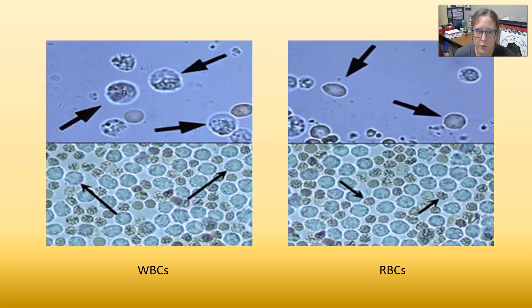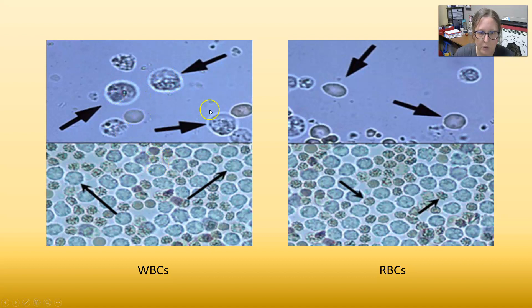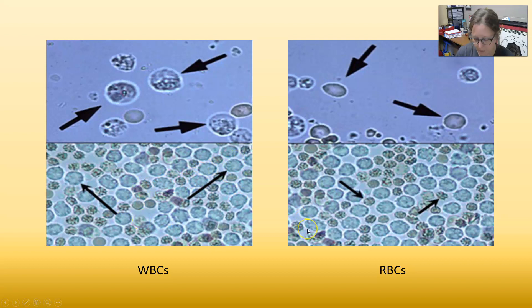This photo shows white cells and red cells. The bigger ones with visible granulation are white cells, and the smaller ones are red cells. On the bottom portion of the photo, the larger ones are white cells and the smaller ones are red cells.